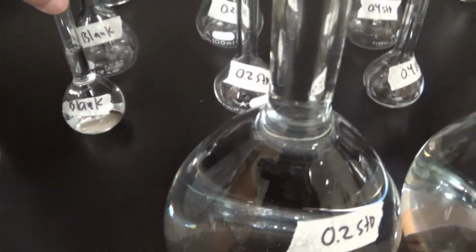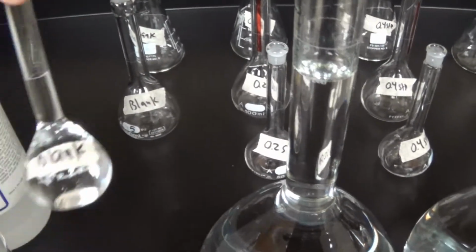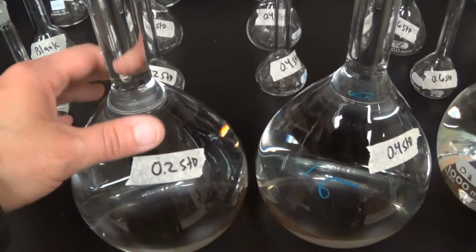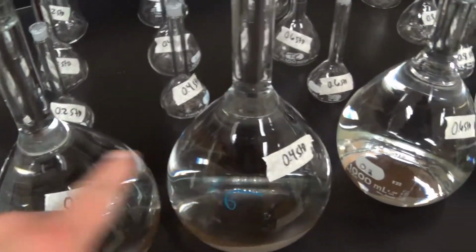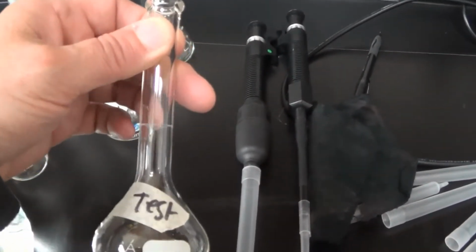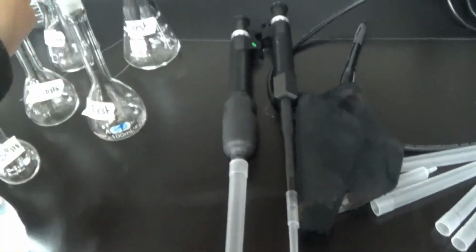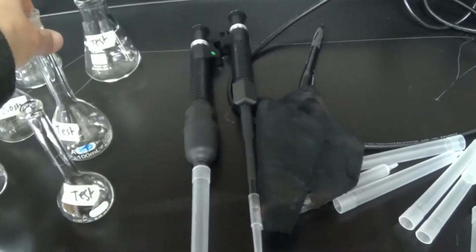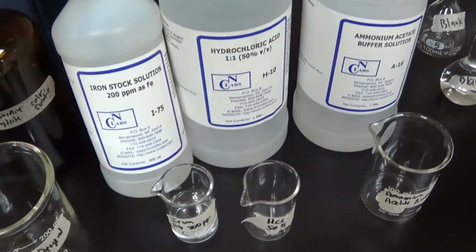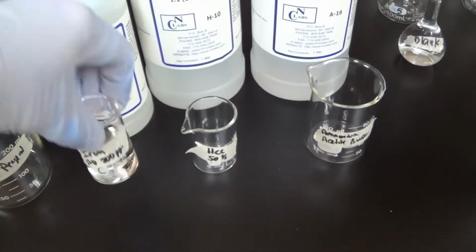So right here, I have a blank. I just measured out 50 mils of DI water. We don't need to fill a big one and pour some in here because we're not adding anything to that. The big flask is just to make our standards and dilute up the iron stock solution. Same thing with the test. The test we're not diluting up. We're just going to add 50 mils of the test solution and then add it to our 100 along with our acid and our ammonium acetate and our color reagent, and dilute up to 100 and add it to the flask for mixing.